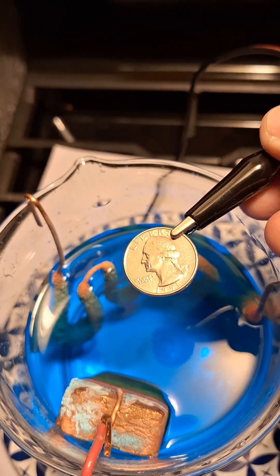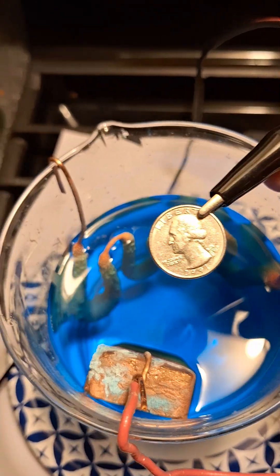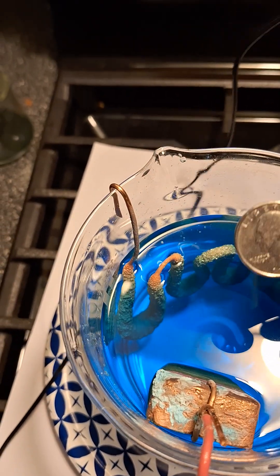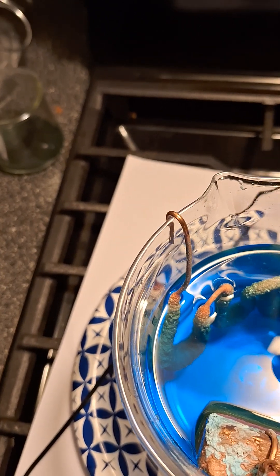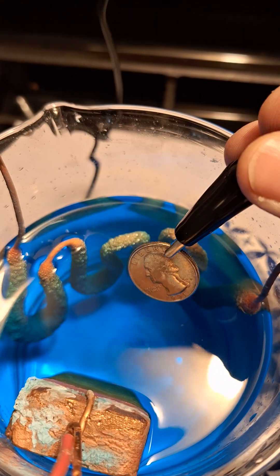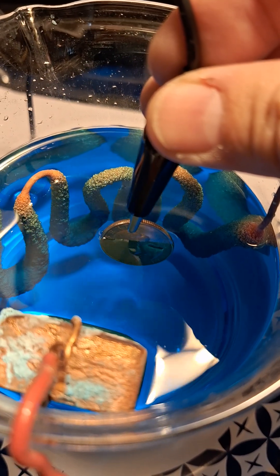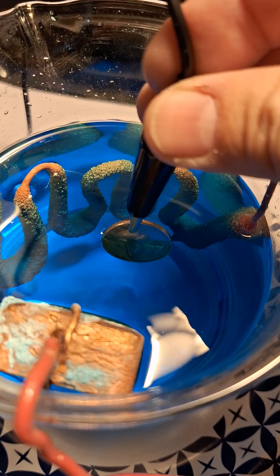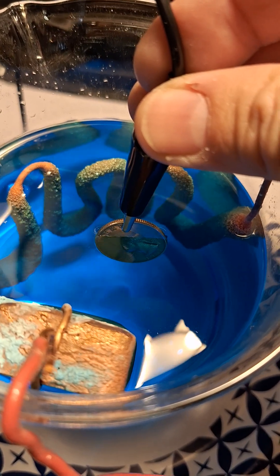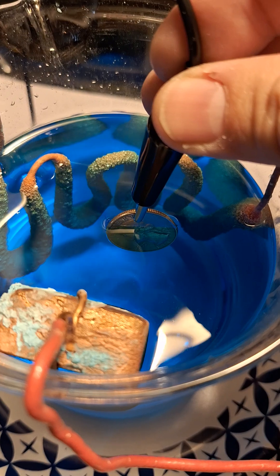After cleaning the quarter with isopropyl alcohol, I connect it to the negative side of the power supply and then dip it into our copper sulfate sulfuric acid plating solution. Right now we're at about 120 milliamps current.